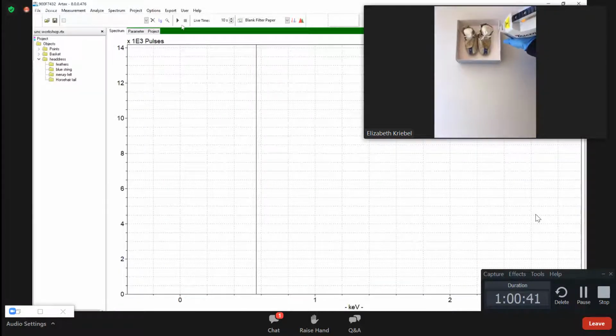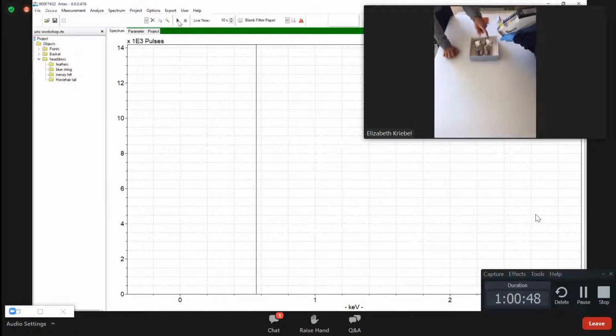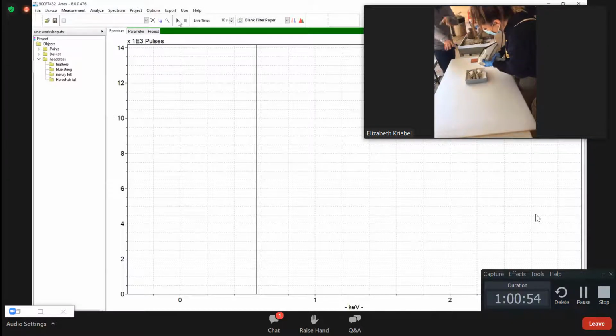73.1.4. And do you think we should start with just the plain leather bundle? But you see how this is folded over and there's beads right there? You might get the beads underneath. I would actually measure this side right here where you've got more of a blank area. Feel free to move the box and all that, so that way you can have the box as parallel. Whatever is easiest.